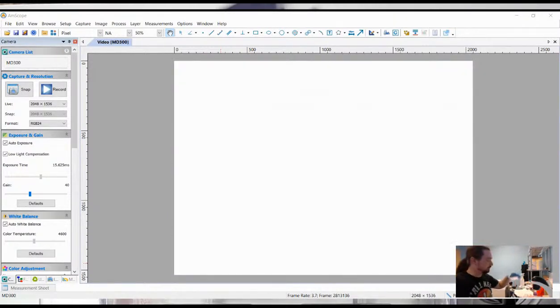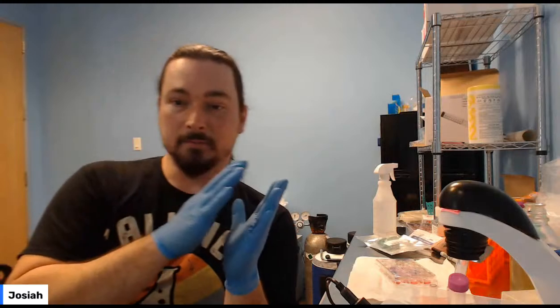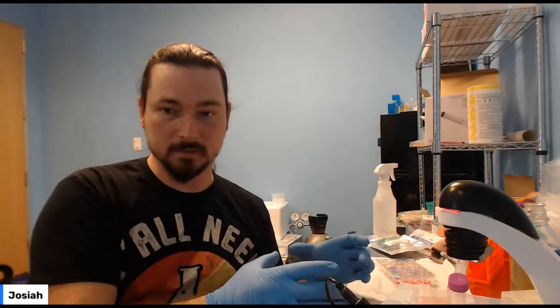But it shows you, even if the cells aren't happy about it, they've been genetically modified, and that they've expressed their new gene, which comes from a bacteria, and you're putting it in a human cell. They make the new gene, and they can now digest something that they couldn't digest, so they break down the X-Gal, and it turns blue. So remember your timeline. It's going to be today.